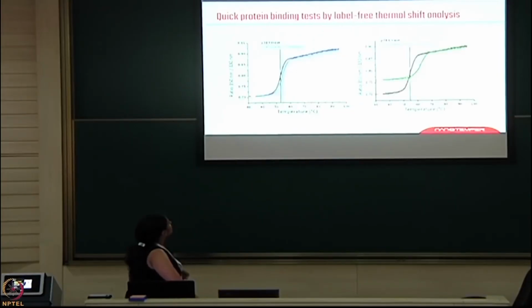Now this is a thermal shift assay that we have done, where we have taken a kinase, and then the kinase is treated with a ligand molecule. You can see the shift in the assay. You can see protein alone was giving a shift at 50-55, and once it's added with the ligand, the shift has gone to 62. So that is how you can check the thermal assays.